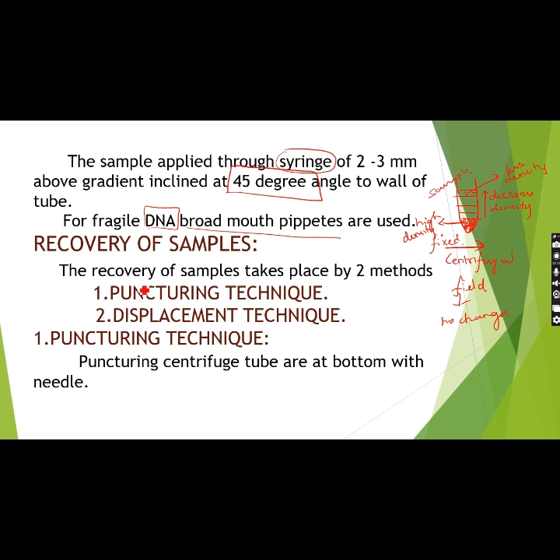For this, recovery of a sample can be done by two methods. One is the puncturing technique and the other is the displacement technique. In the case of the puncturing technique, as we can tell from the name, it involves puncturing of the test tube.